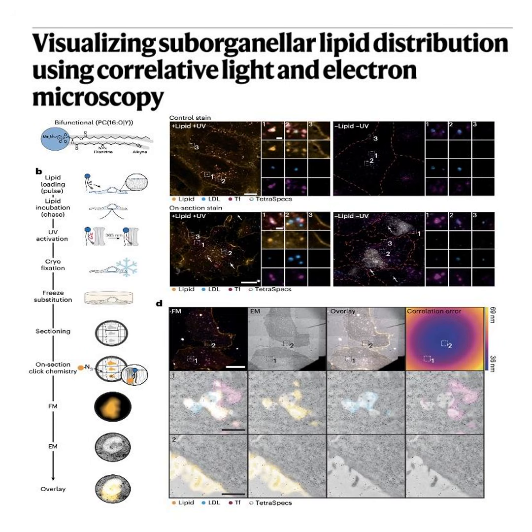Number 2, K11M is a polar resin. It allows deep reagent penetration, giving you the overlapping signals required to calculate true 3D volume density. And number 3, while tagging lipids with nanogold beads works in theory, it only yields about 6 to 11 beads per structure, which is far too sparse.